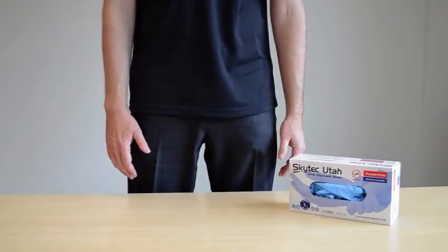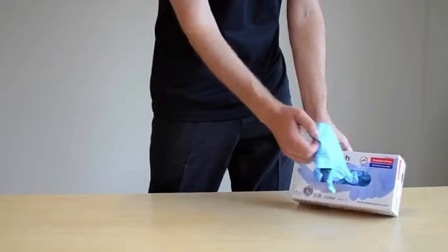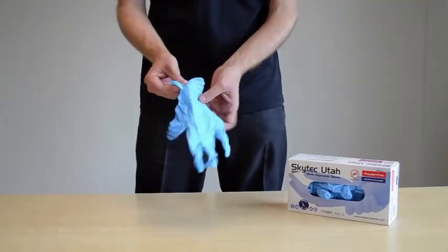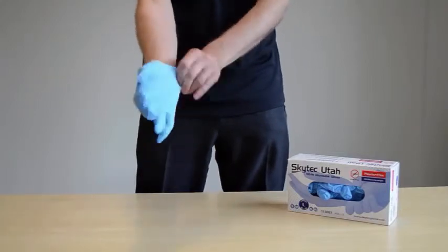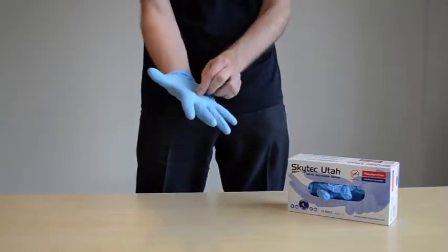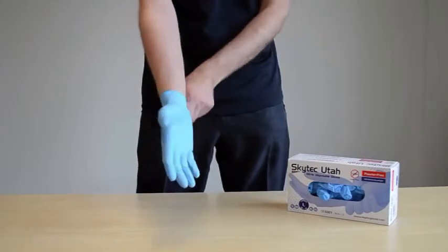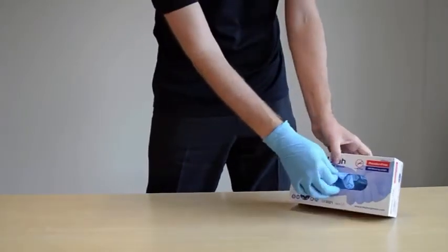To don, first select a glove from the dispenser and check for any visible tears and other defects. Gently open the glove at the cuff and insert the hand into the glove. Once the hand is inserted, move the fingers down into the glove's fingers to properly align it and ensure you have a snug fit all over. Roll the cuff of the glove down the wrist until the glove is secure. And now apply the same technique for the second glove.